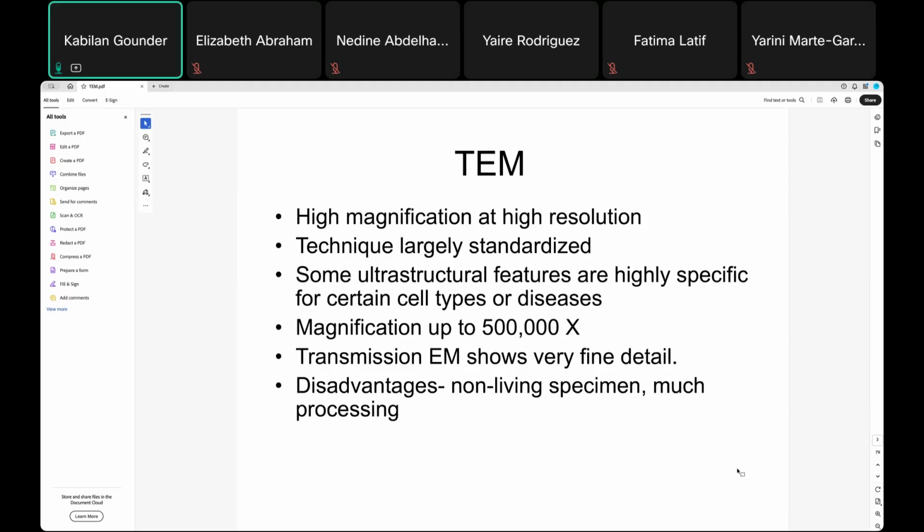It requires expertise for detailed structure, and if there are any changes in ultrastructure, you need to interpret the data so that you can understand further, because with changes of cell types, we have to find out what it really is. So you need expertise to understand the structural changes. Also, as we see, you get ultrastructural details, but we can only see processed samples.